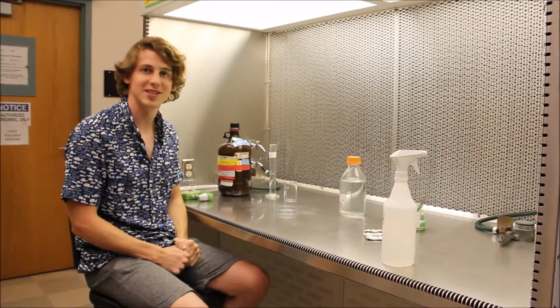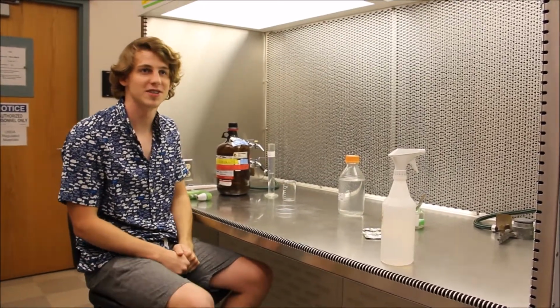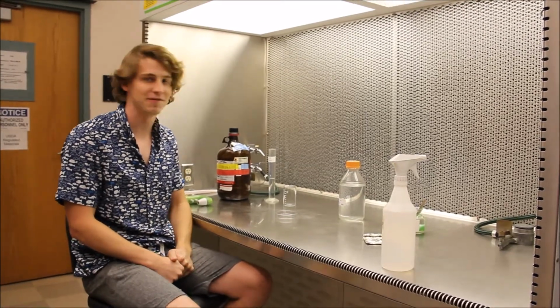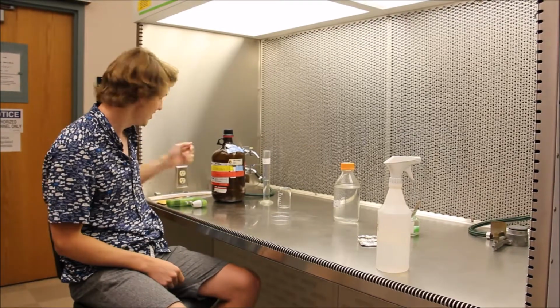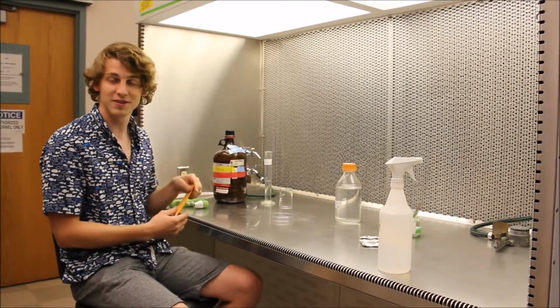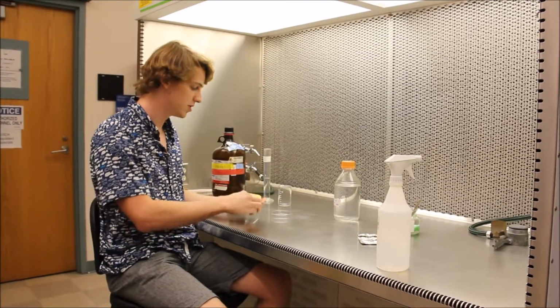My name's Tim Chappell, and today I'll be showing you soybean hairy root transformation using Agrobacterium rhizogenes K599 in soybean. The first thing you need are your seeds, and for this demonstration we'll be using some Jupiter seeds.